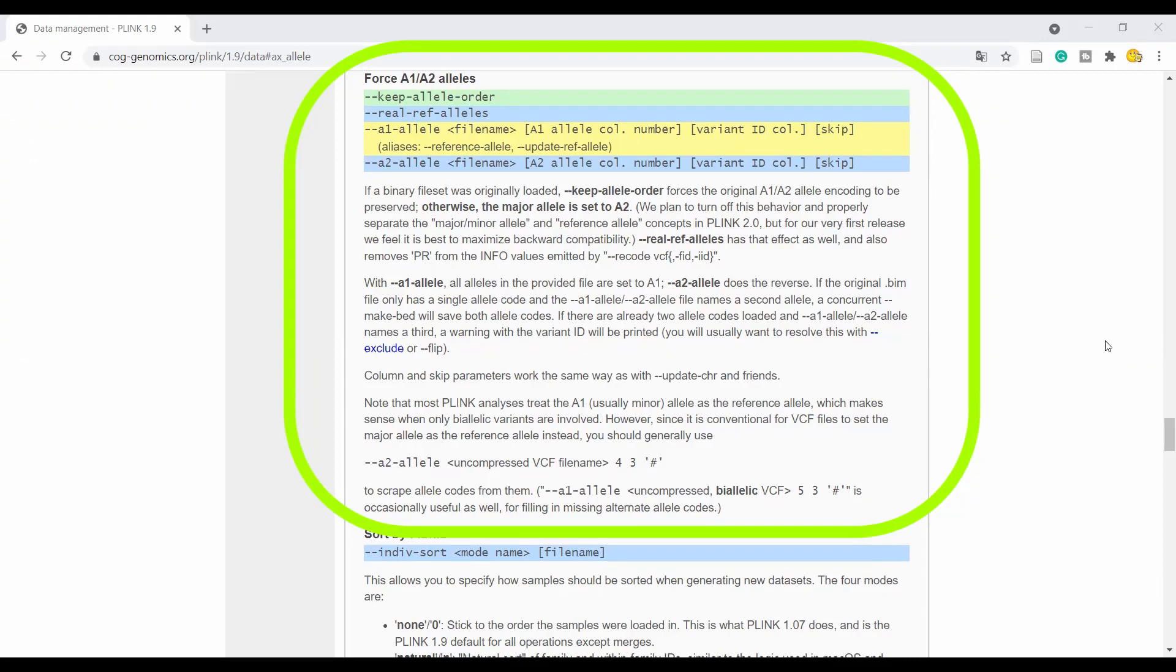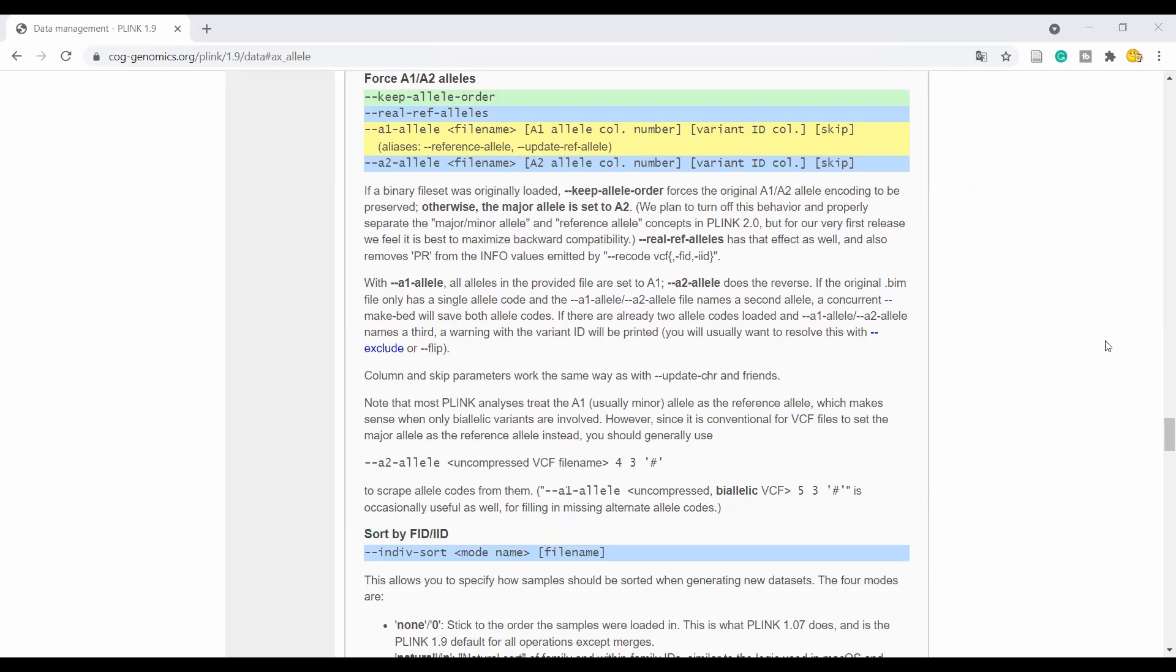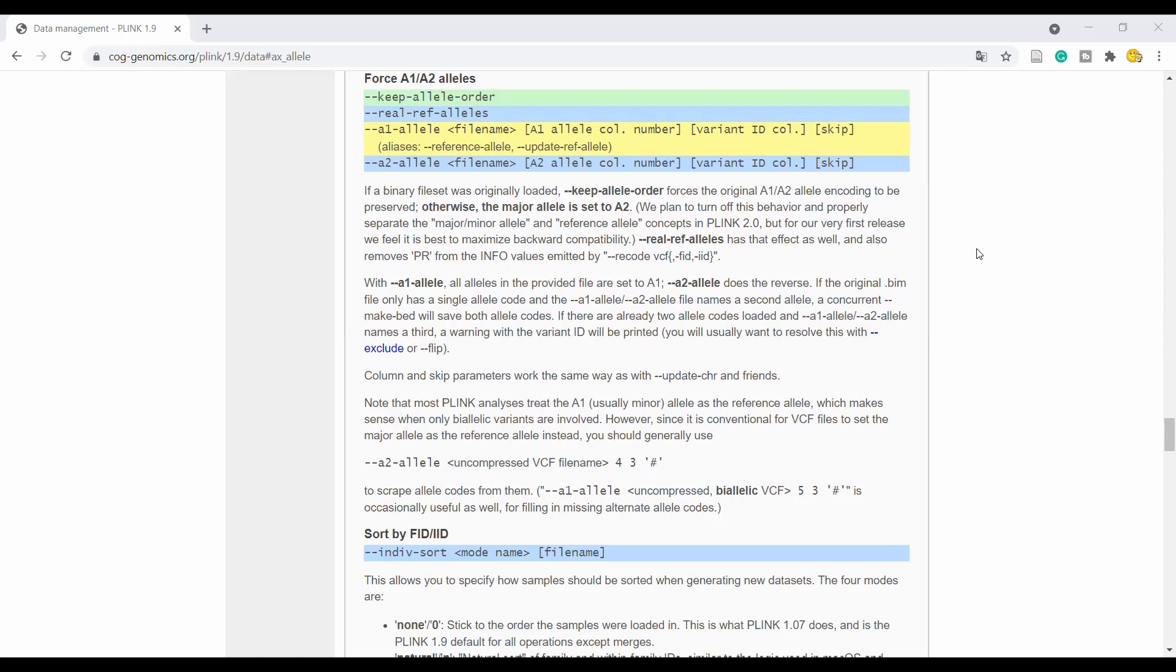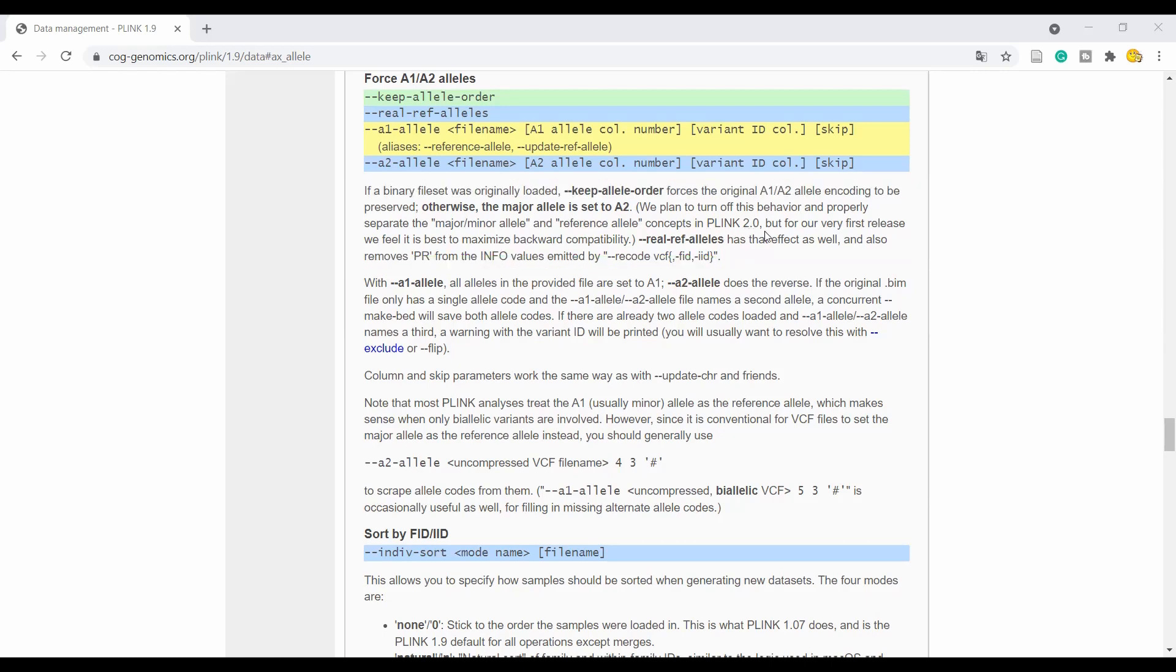Here is the appropriate part from the Plink website about the A1 A2 allele status. Again, if the minor, major, and the reference allele status is relevant for your analysis, I highly recommend you to go through this part and implement the appropriate options in your Plink pipeline. I know this part might be a bit tricky but I just wanted to highlight an interesting piece of information here that also the Plink authors recognize this situation to be somewhat confusing. So here they say we plan to turn off this behavior on the minor-major allele and properly separate the minor-major allele and the reference allele concepts in the Plink 2 release. So we hope to get a bit more clarity there.